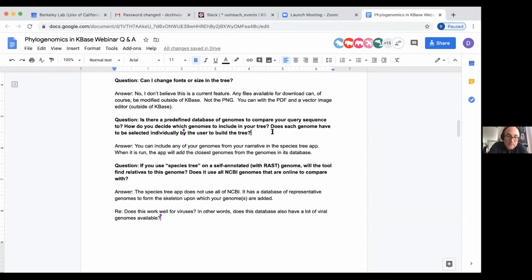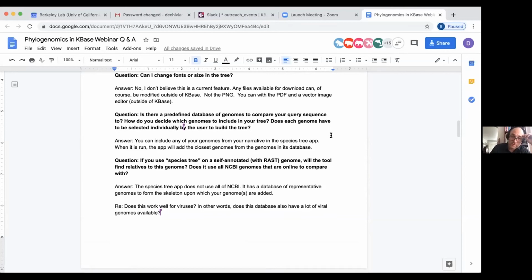We don't. There's functionality coming online to support whole system, not just RefSeq, gene homology search. But for right now, for the purposes of this tutorial, where you're trying to get into phylogenetic reconstruction and so on, it's best to start with a collection of related genomes using a species tree search.